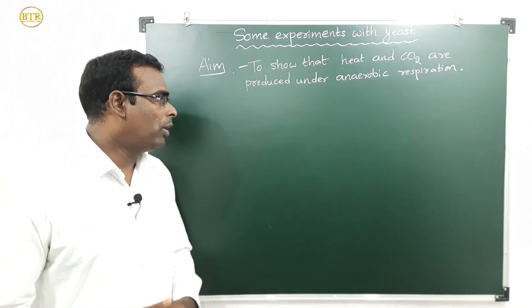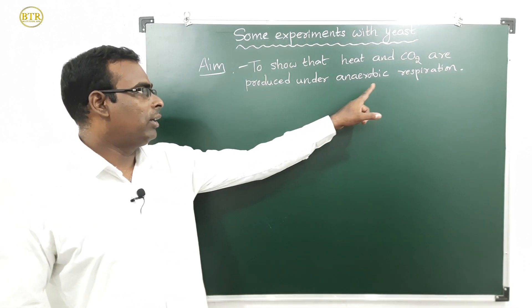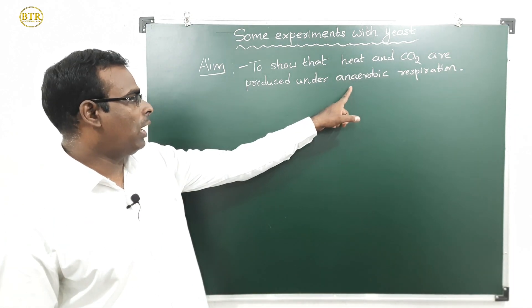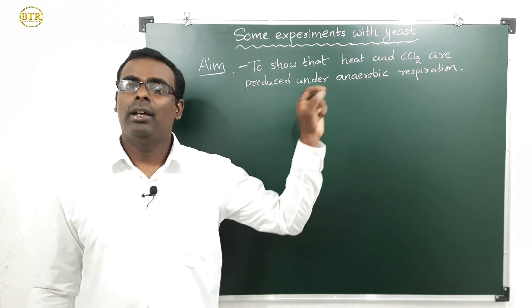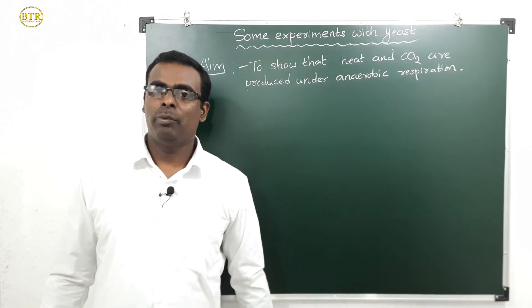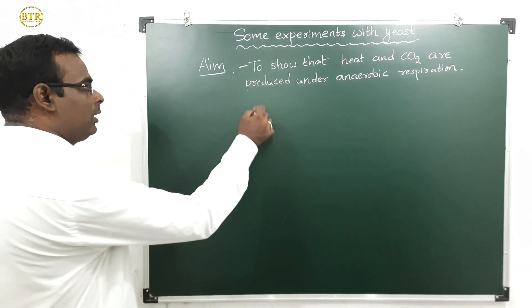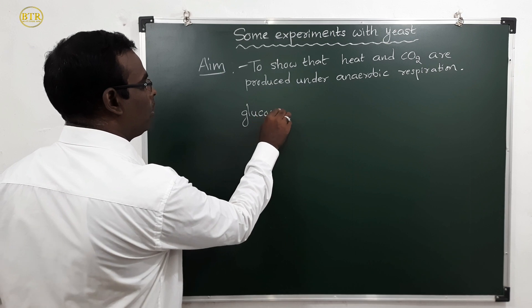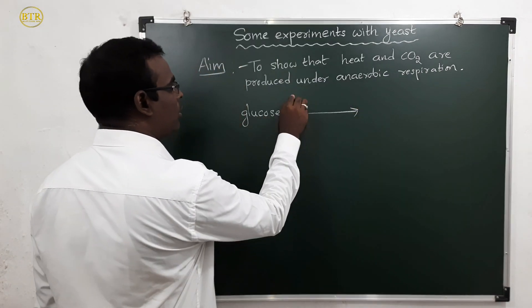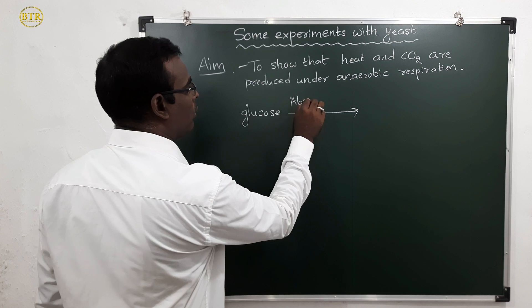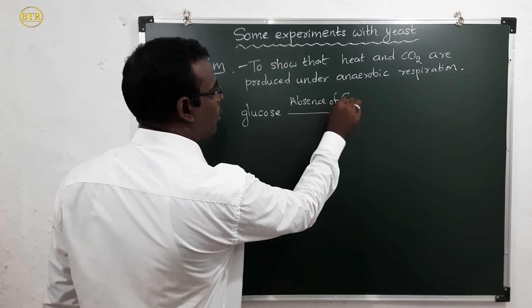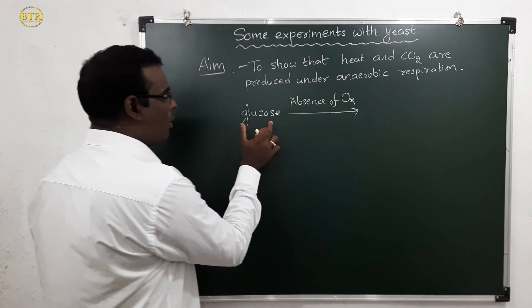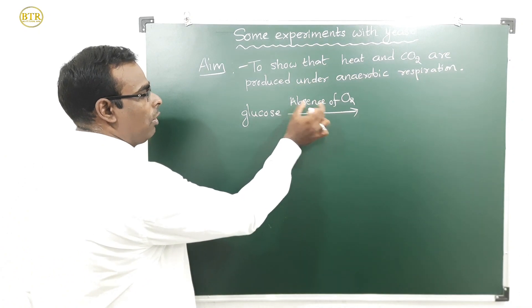In this lab activity, we are going to prove anaerobic respiration — respiration taking place in the absence of oxygen. In anaerobic respiration, the glucose molecule breaks down in the absence of O₂.